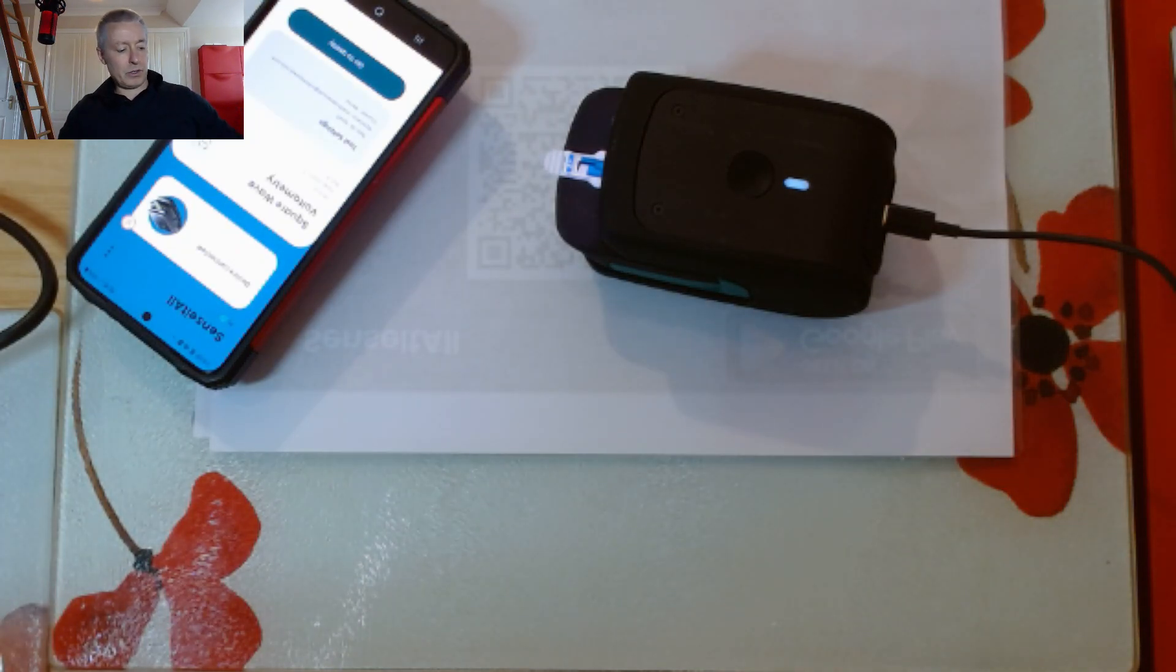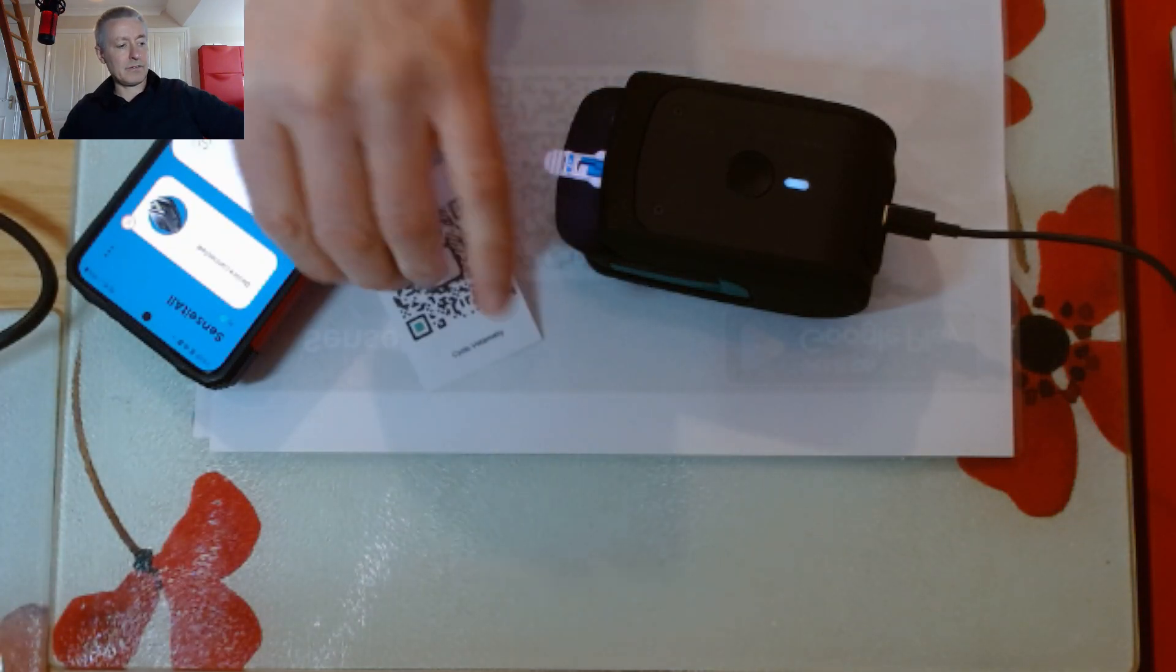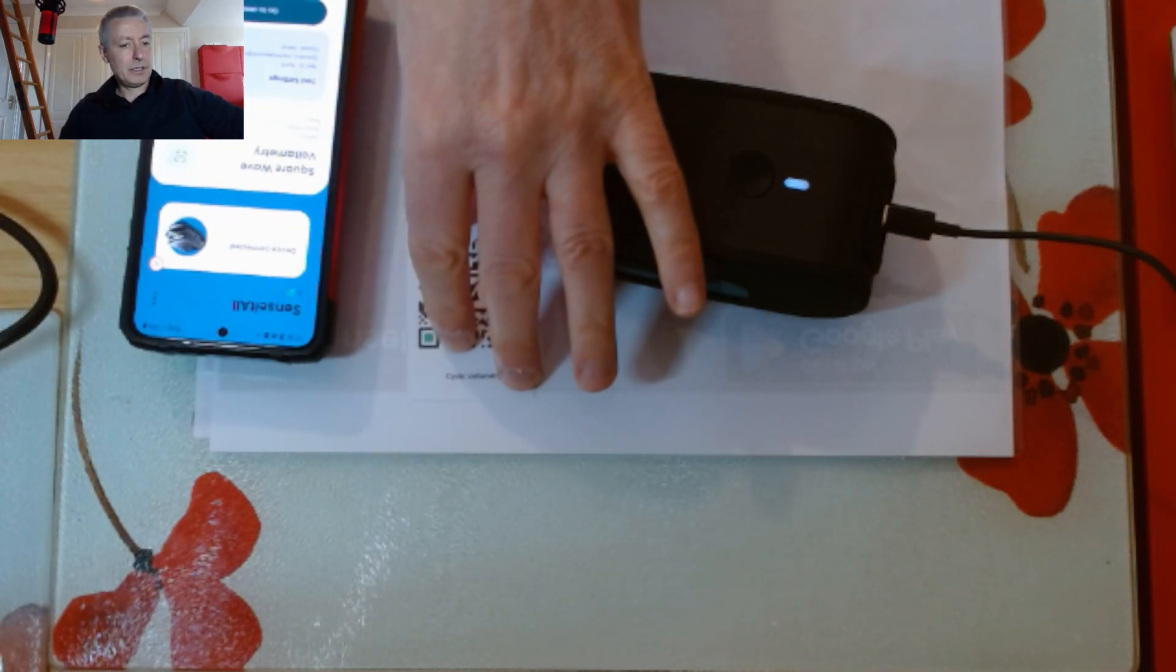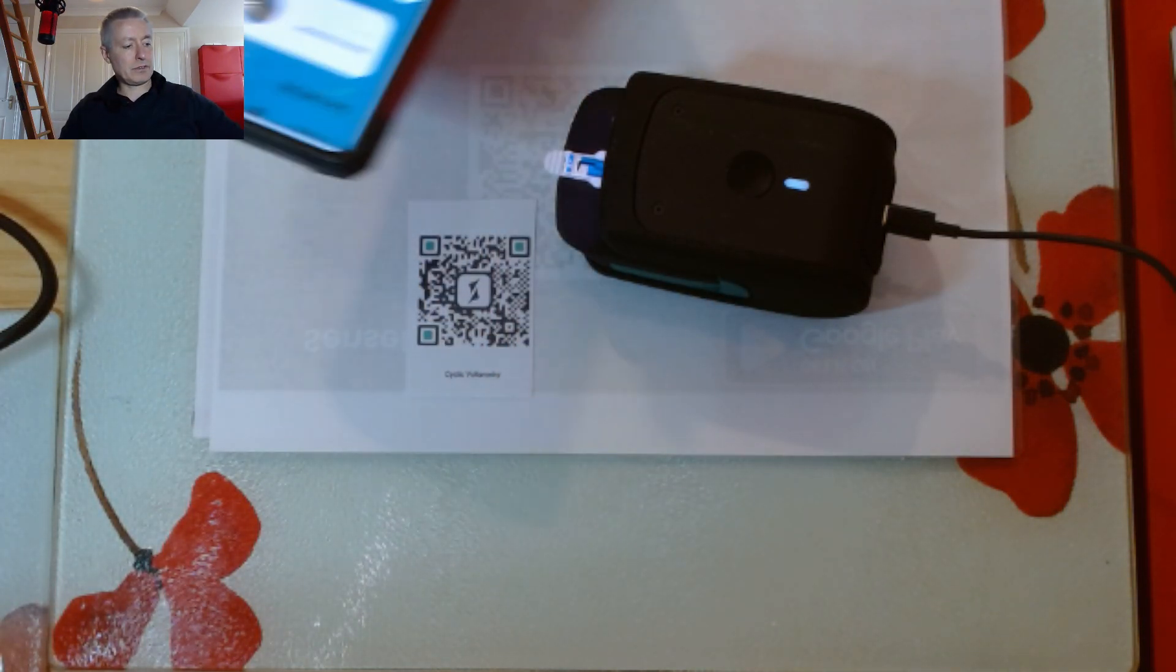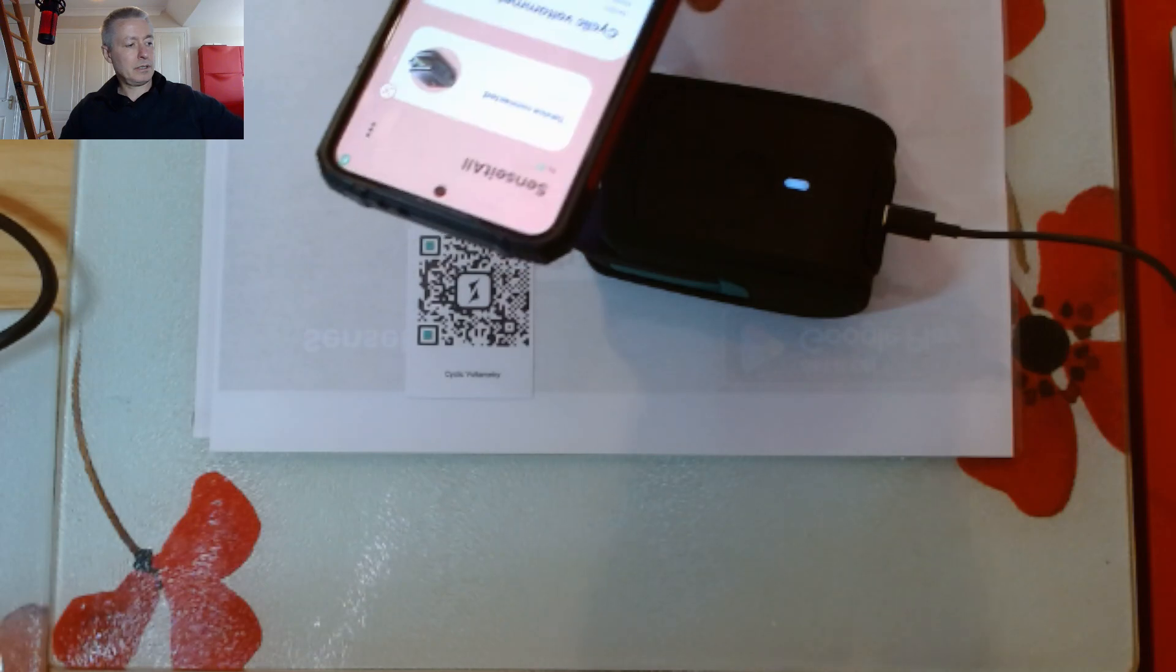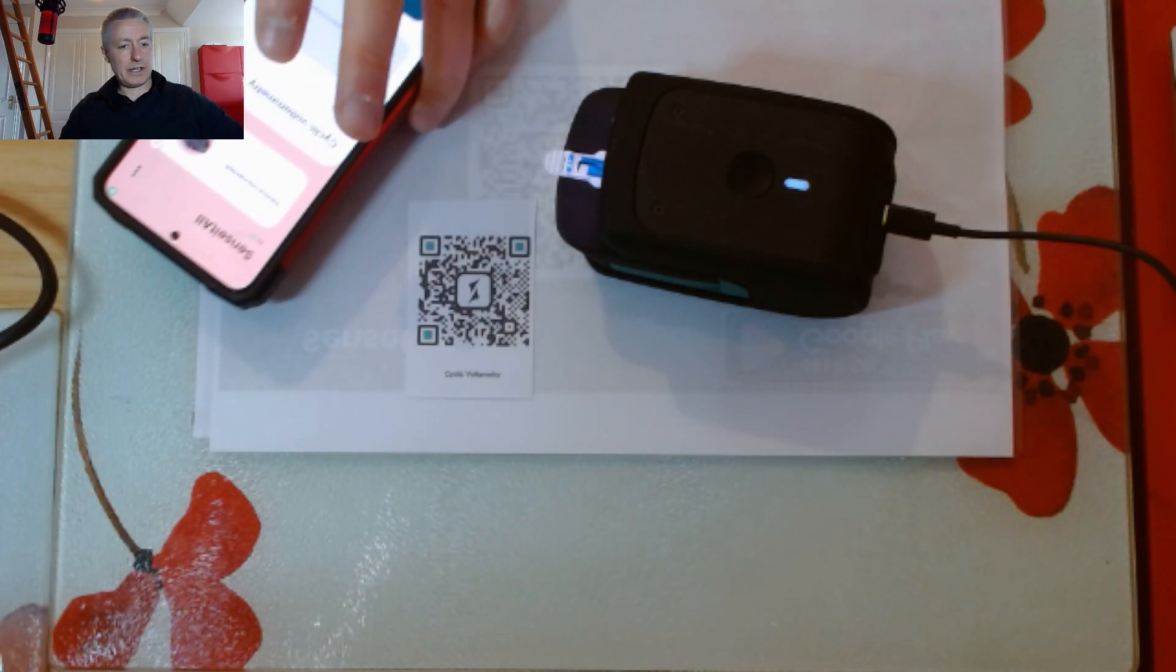If you want to do the old classic cyclic voltammetry, I'll just bring the QR code for cyclic voltammetry. You can just scan that and that will give you cyclic voltammetry.